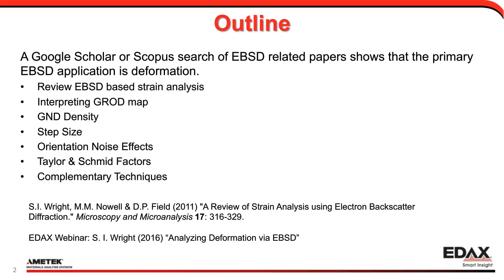Quite a bit of the background information for this is in a paper that we wrote in 2011 in Microscopy and Microanalysis, and that's a good source of information in terms of the tools that we have for analyzing strained materials. I also gave a webinar a few years ago on similar information, more focused on the tools besides GROD, which was new at the time. So without further ado, we'll go ahead and follow that outline.